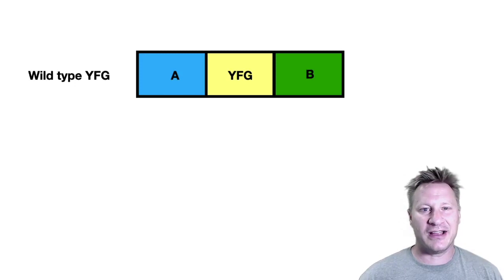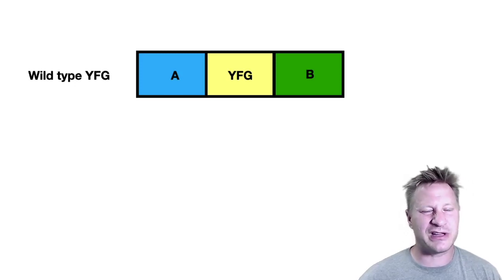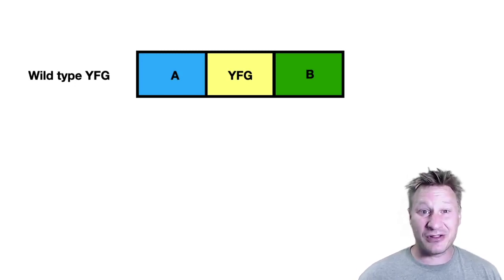Typically when I build them within the genomes, I'm using about 500 base pairs on each side of the region I want to manipulate. I've gotten away with about 100 base pairs on each side. You can even go a little bit shorter than that. It just makes your life a little bit more difficult when you're trying to manipulate the genome. We typically go with 500 base pairs, but again, the larger the better. Thousands of base pairs would be even better than 500 base pairs here. All right, so we've got region A, upstream, region B, downstream. We'll say it's 500 base pairs each of those, and we'll go from there.